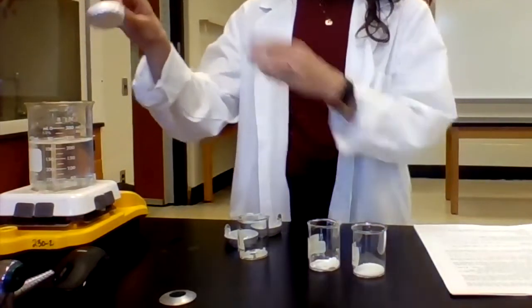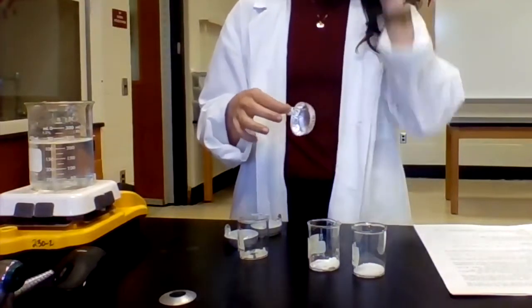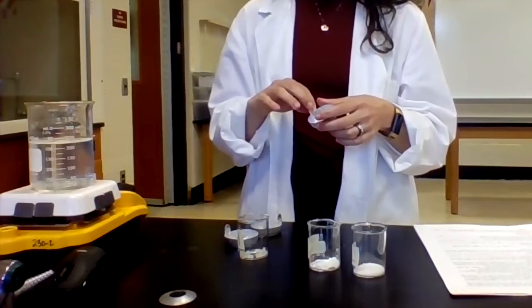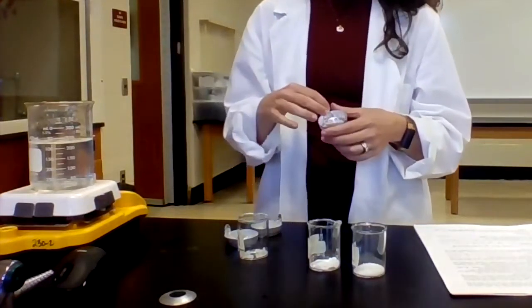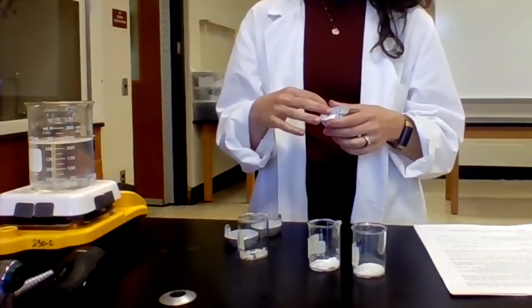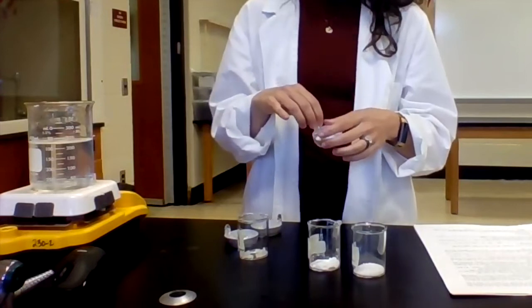If the heat from the hot water bath is enough to melt the solid, that tells me it is likely non-polar covalent, because 100 degrees Celsius would not be enough heat to melt an ionic compound for sure, and most likely not even a polar covalent compound.